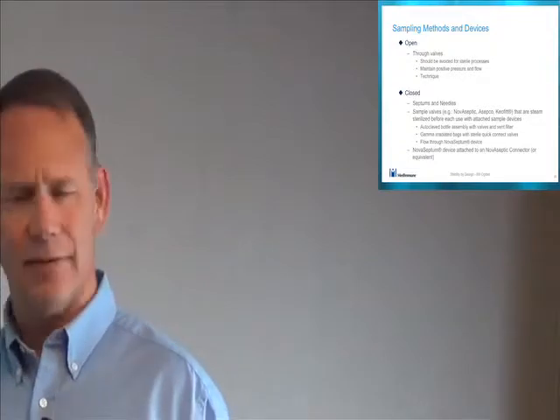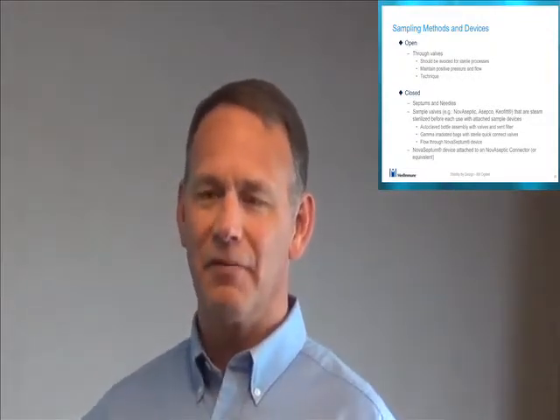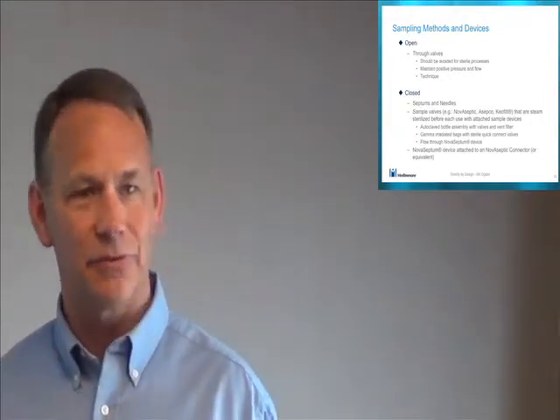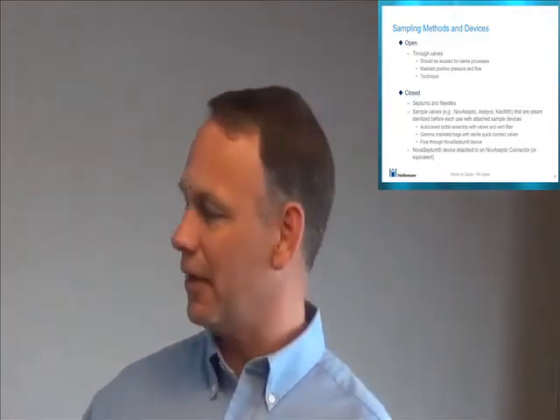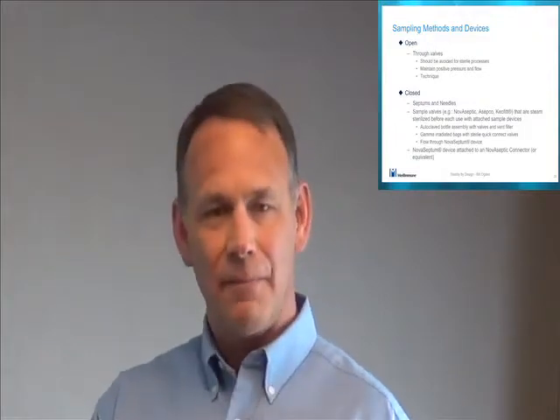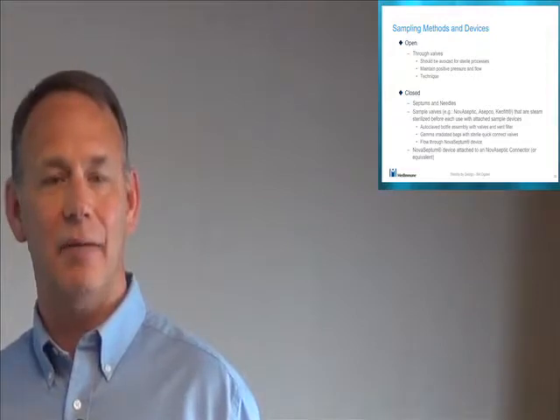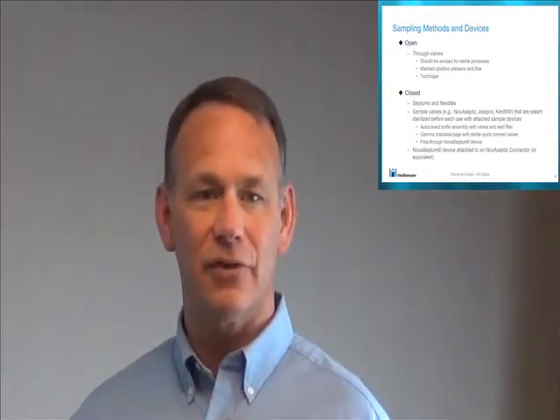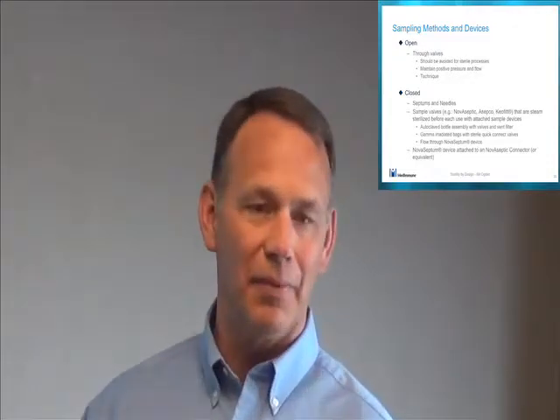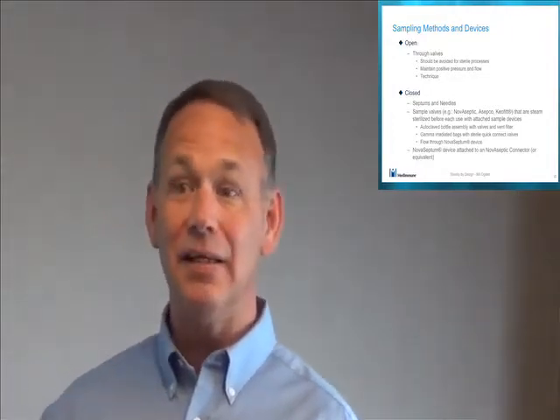And there are other brands now. There's at least one other company making something very similar to a Novoseptum device, only it's considered disposable, so you're throwing away the entire assembly every time. So yes, if you know exactly how many samples you're going to take and you're never going to need extra, that style of sampling is probably the best. You don't have to worry about the associated piping. You don't have to do the extra SAPs and things.